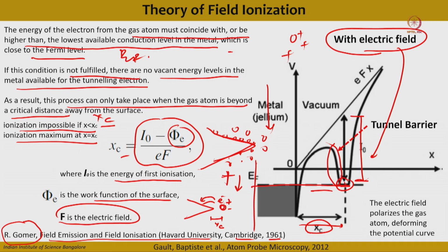Fine. And if you put up a phosphor screen, then what will happen, due to this positive potential at the tip, these electric field lines will accelerate these gas atoms, which go towards and hit the fluorescent screen. So these gas atoms are actually the image formers of the tip surface. Wherever they hit the fluorescent screen, it is exactly the position of the atoms or the crystallographic terraces. More importantly, the crystallographic terraces develop on the fluorescent screen through these imaging gas atoms. Okay. So I hope the physics behind this field ionization is clear now.